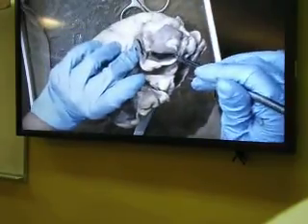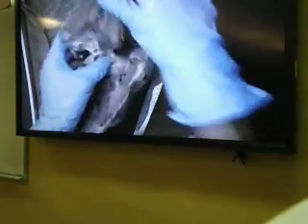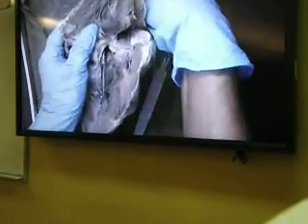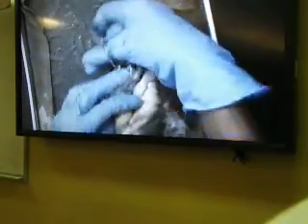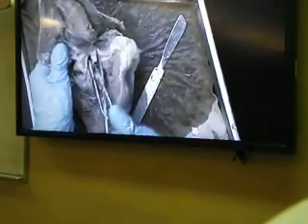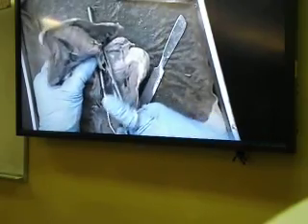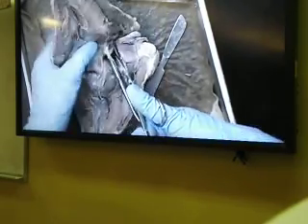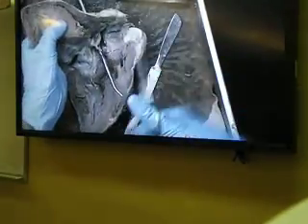So if I push a probe through the aorta into the left ventricle and cut that entire area, following the probe, I actually will be able to see the aortic semilunar valve better.